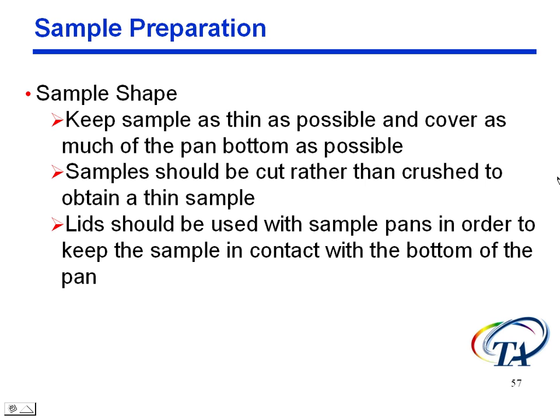Otherwise, we always recommend having lids. But it's even probably more important with modulated DSC. Since we're putting a modulation onto there and we're heating it up and down at different rates, it may not be increasing and decreasing in temperature, but at least at different rates, we want to make sure that sample follows that.